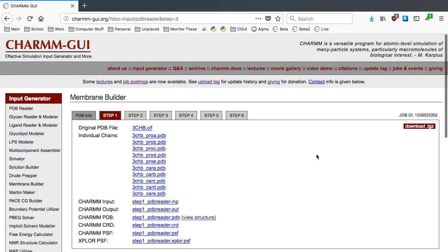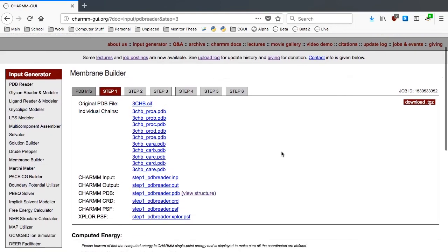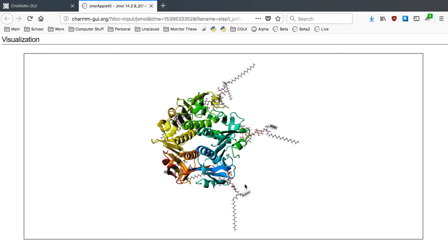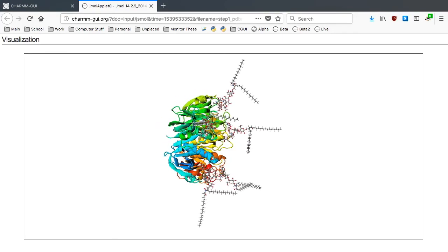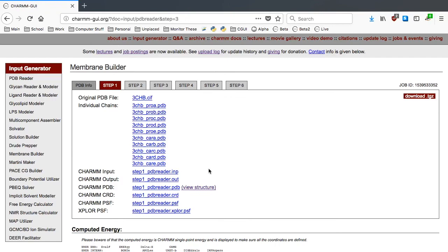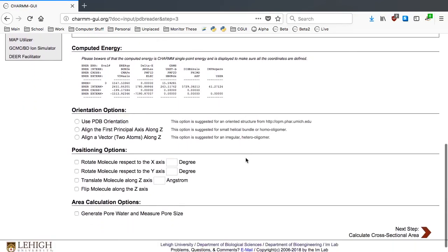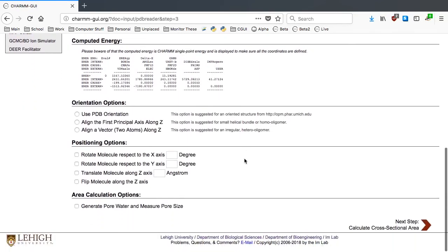You should first confirm that the CTB-GM1 complex model was built correctly by clicking View Structure. A PDB file from RCSB is not generally oriented with respect to the membrane bilayer, like our model, so we first need to orient it.